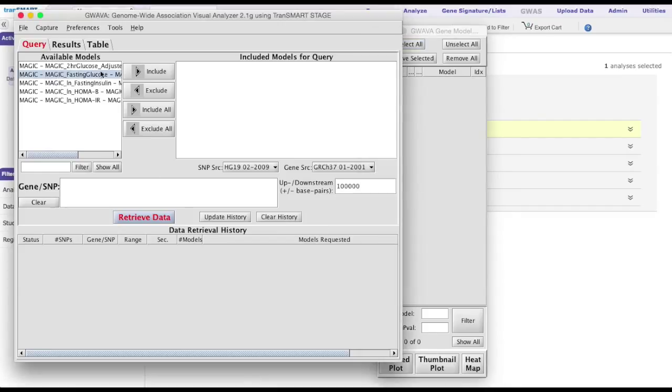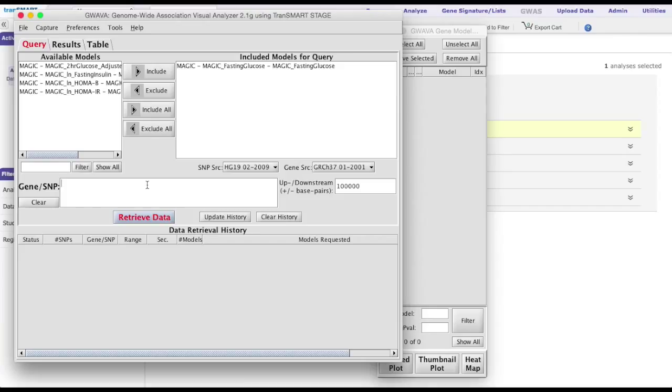After typing in a gene of interest, for example TCF7L2, click the Retrieve Data button.